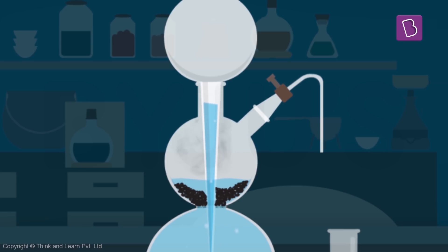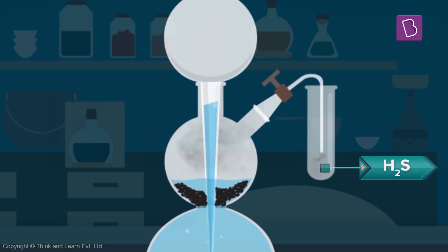Now there's a stopcock on the side. I just open it and that's it, I get my gas. Really cool, right?